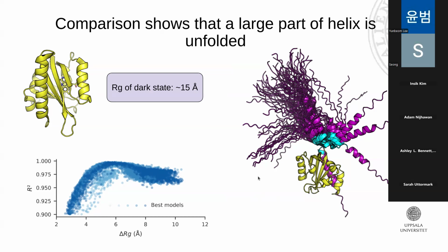We also did a similar analysis. In addition to the J alpha that we had unfolded, we also looked at the N terminus, but unfortunately we could not see any difference whether this was unfolded or not. This is also something that has been debated within the field, whether it has something to do with the J alpha unfolding, but unfortunately our data couldn't really discriminate between this or not. So we had a combination of both the J alpha and the N-terminal helix unfolded.